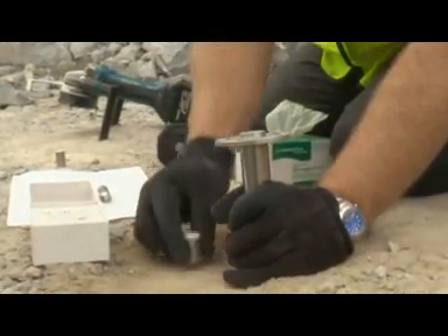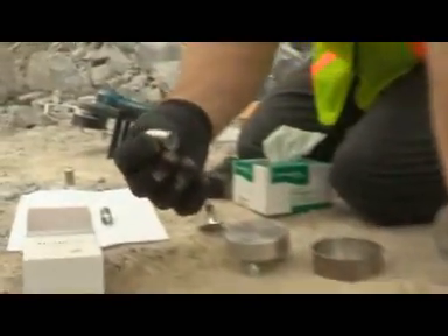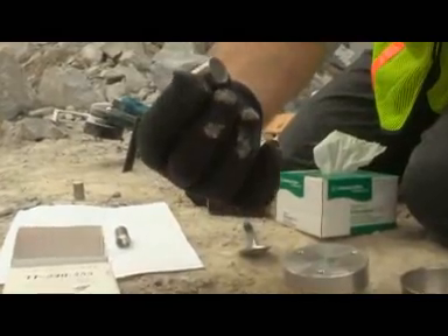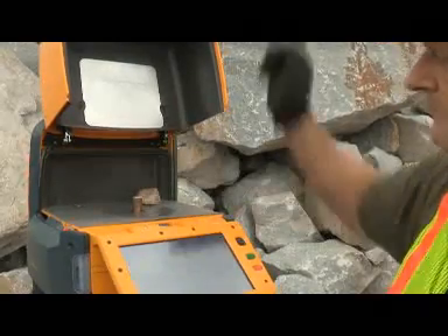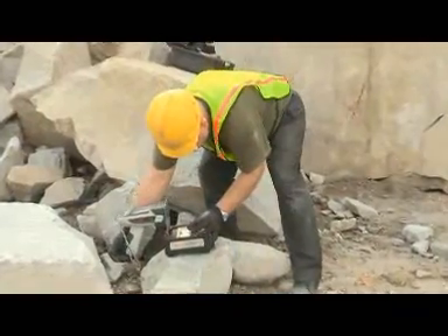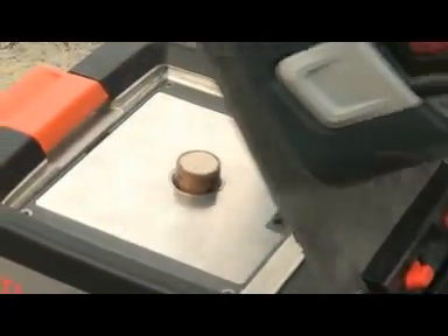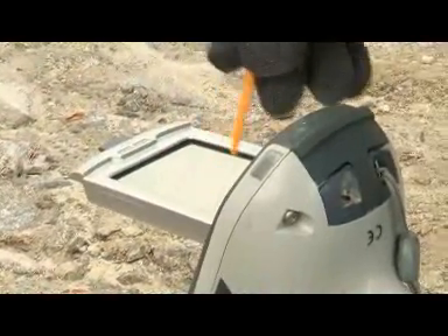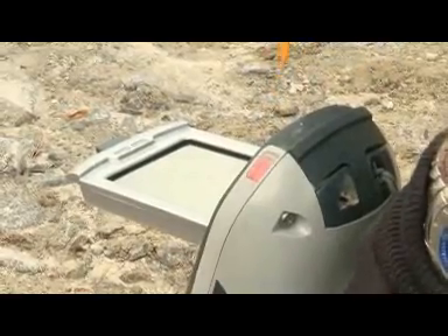The stainless steel pellet press must be at least half filled with material for proper analysis. If it is not half full, you must re-press another pellet. Now you are ready to analyze the pellet. Place the pellet sample directly on the Niton FXL or in the Thermo Scientific field-made test stand, and with the analyzer installed, close the lid. You can now enter the name of the sample on the touch screen of the analyzer for later identification, and then click the trigger to begin your analysis.